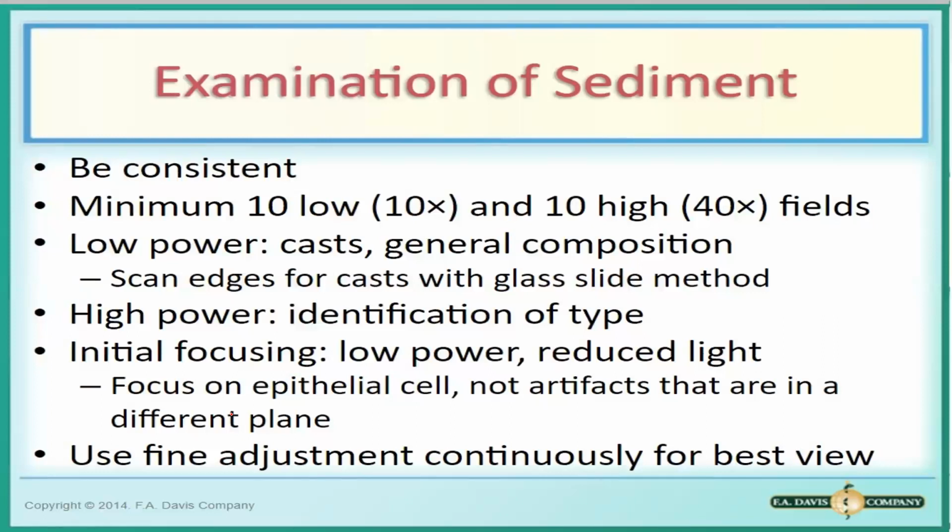Examination of sediments. Minimum 10 low power fields and 10 high power fields. In LPO, generally, yung makikita mo dyan, casts and general composition. Sa high power field is yung identification.